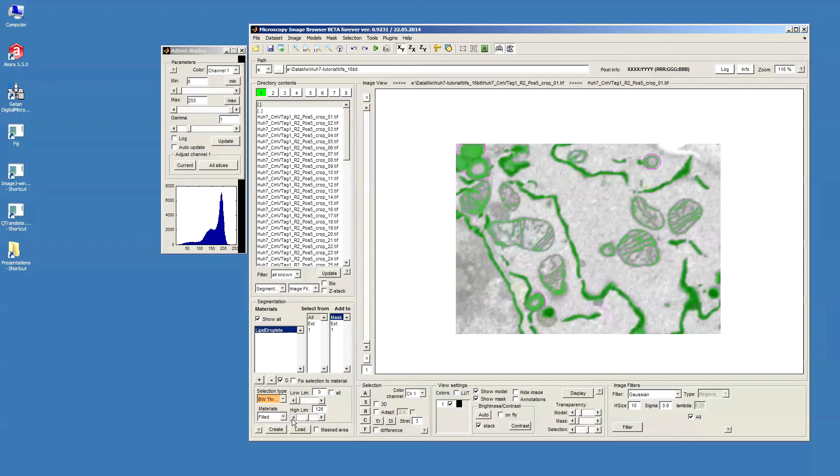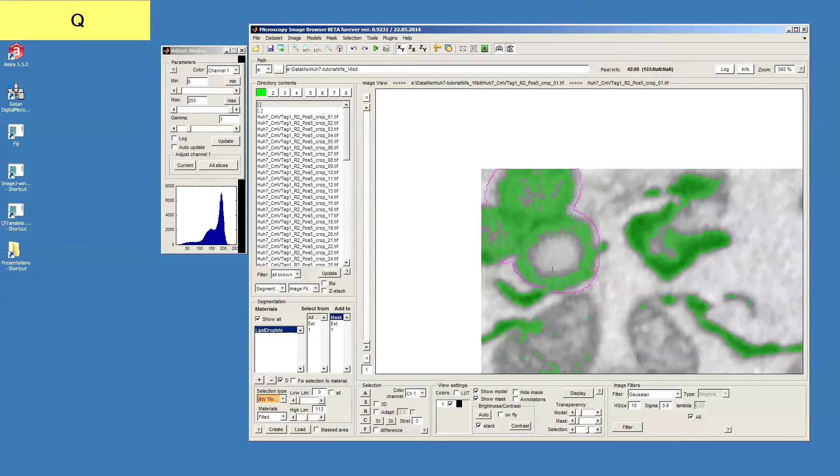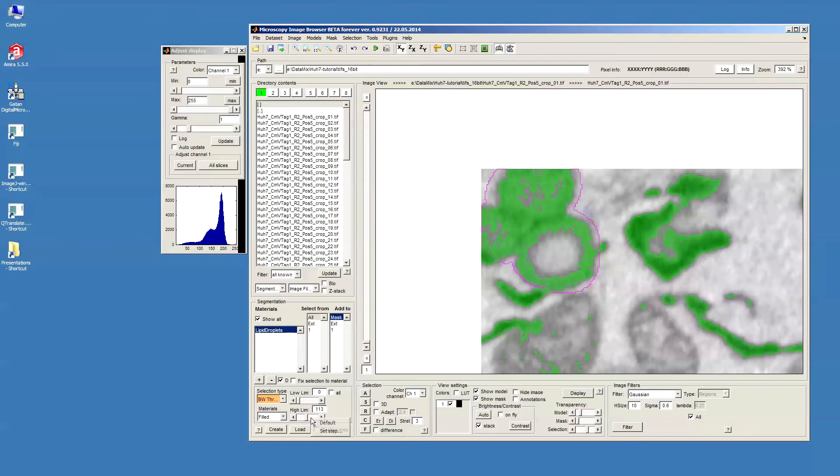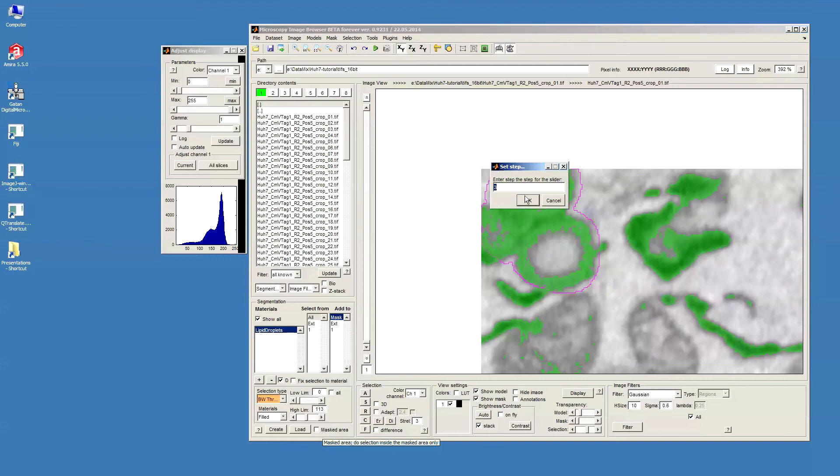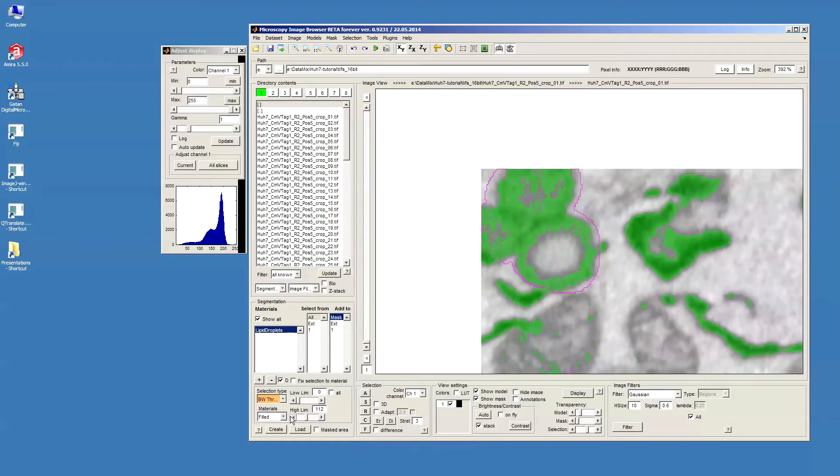I can move the slider or I can press these buttons. And then I can also specify the step for the slider by pressing the right mouse button above this slider and set this step for example to one. In this case each click on this button will change the value for the slider by one.